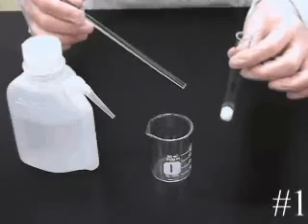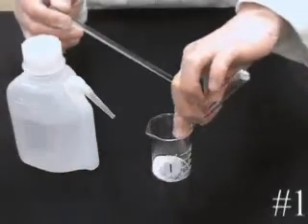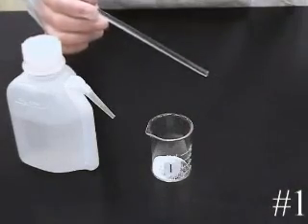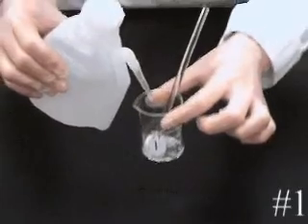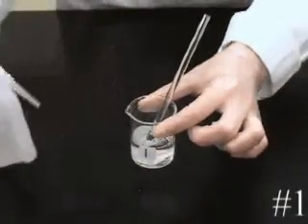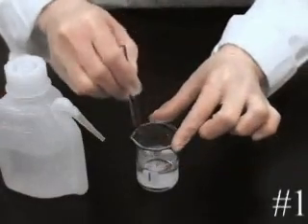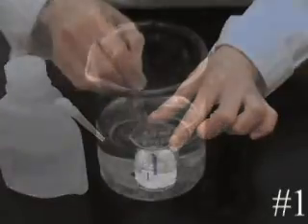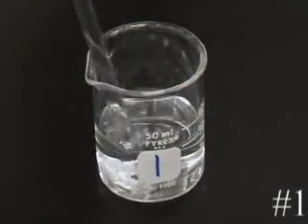We will first make a solution of solid number 1. Approximately half fill the beaker with water. And stir to dissolve the solid. Keep stirring until all the solid has dissolved.